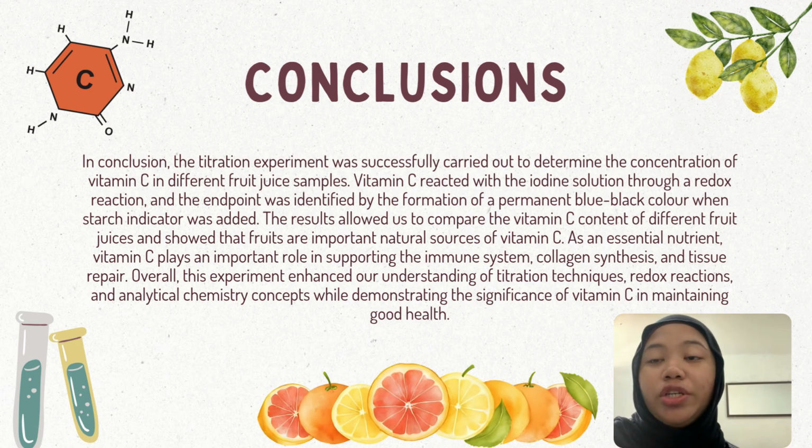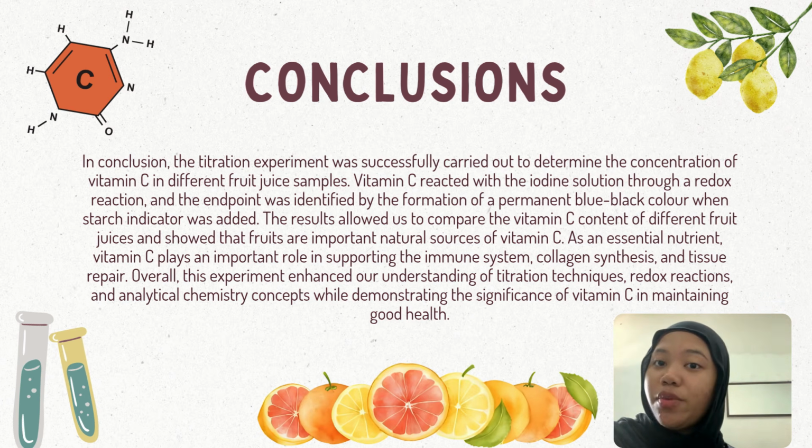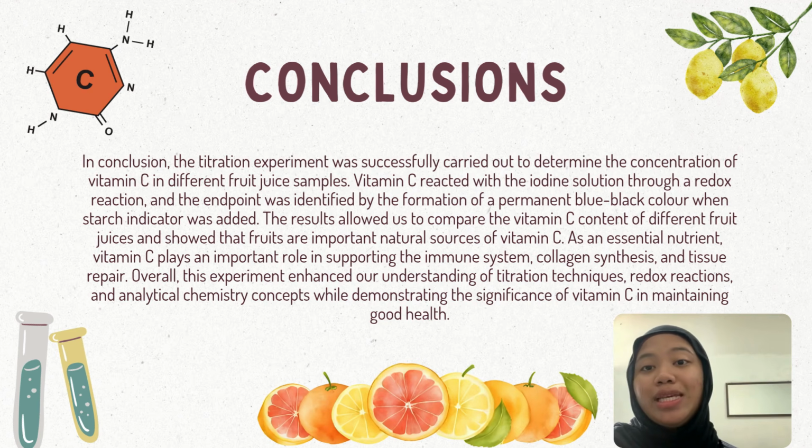As an essential nutrient, vitamin C plays an important role in supporting the immune system, collagen synthesis, and tissue repair. Overall, this experiment enhanced our understanding of titration techniques, redox reaction, and analytical chemistry concepts while demonstrating the significance of vitamin C in maintaining good health.